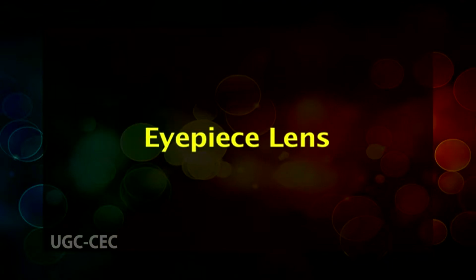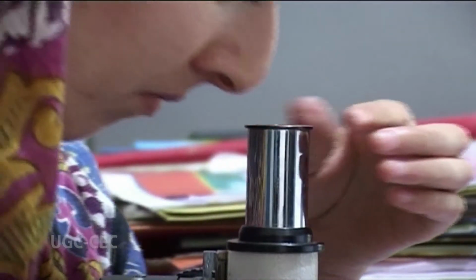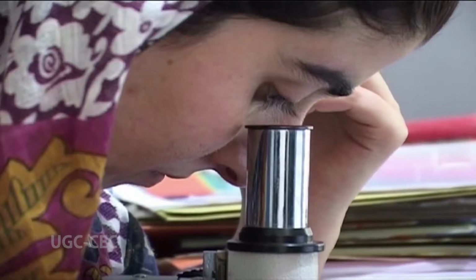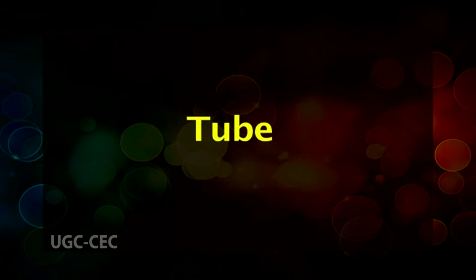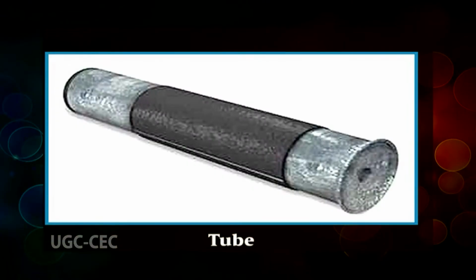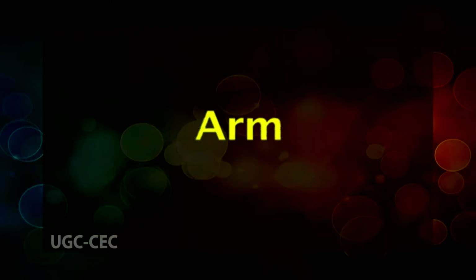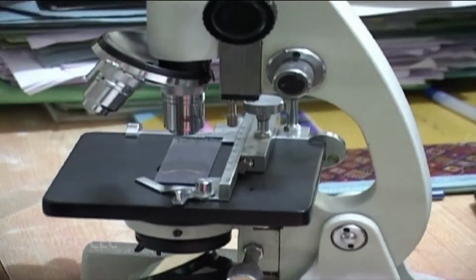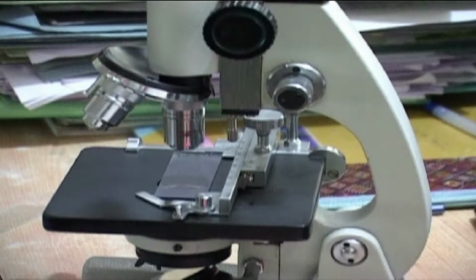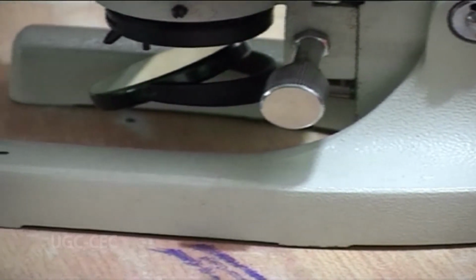First is the eyepiece lens. The lens at the top through which we look is the eyepiece. They are usually of 10x or 15x power. Second is the tube. The tube connects the eyepiece to the objective lenses. Third is the arm. The arm supports the tube and connects it to the base. Base is the bottom of the microscope, used for support.